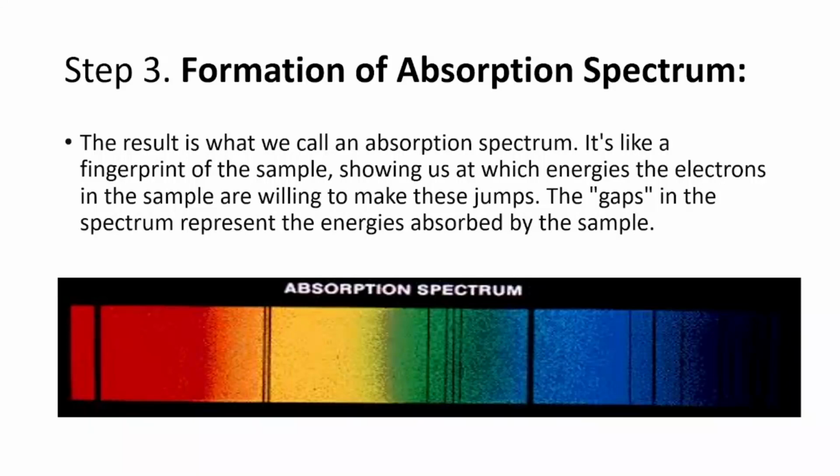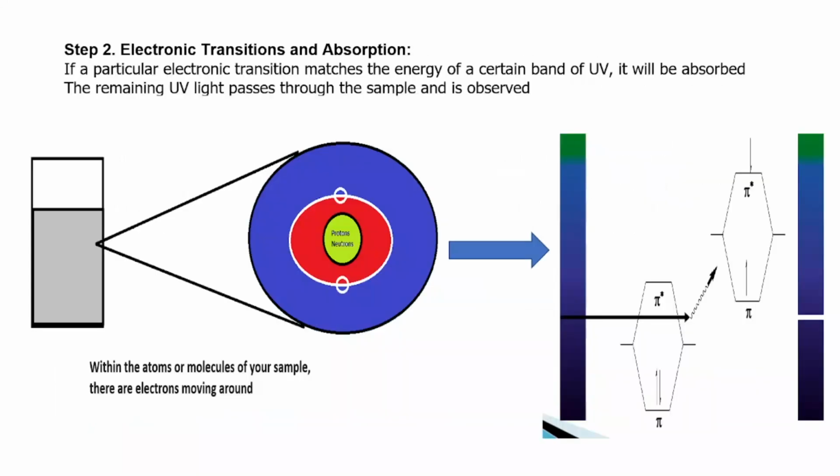All right, good. So let me put all that I said into a simple summary. A summary of all that I said is just in 3 steps. The first thing is expose your sample to the radiation. That is, shine your UV light on the sample. Exactly.